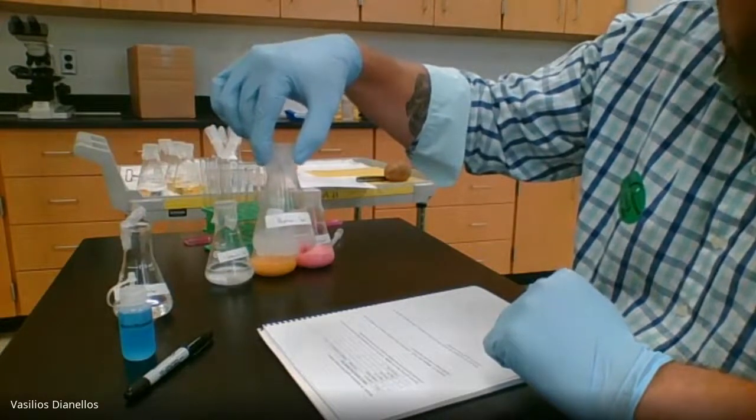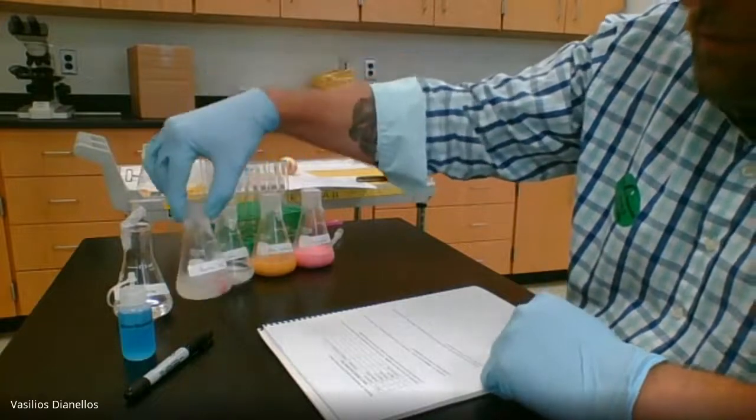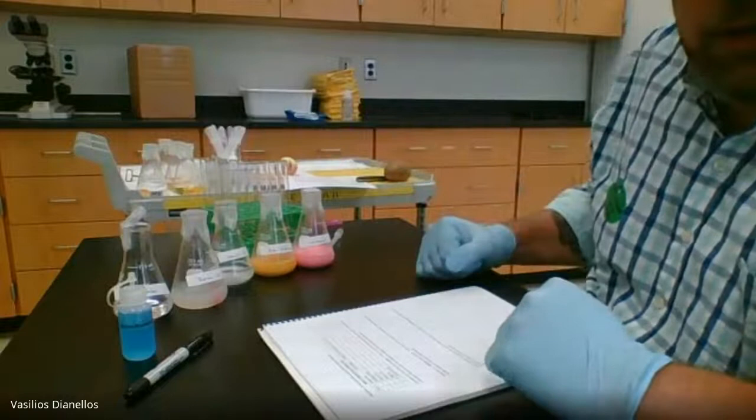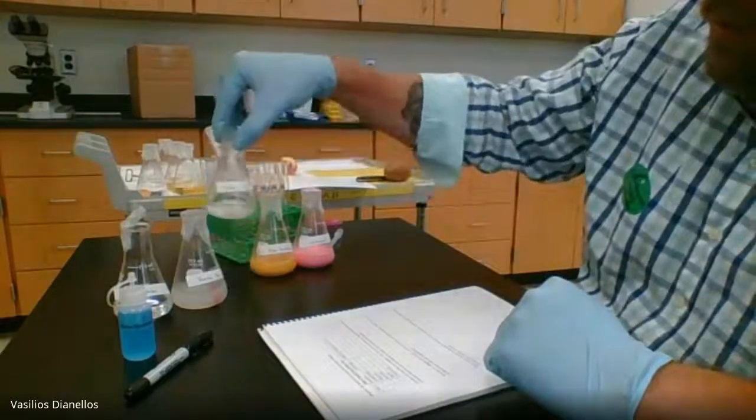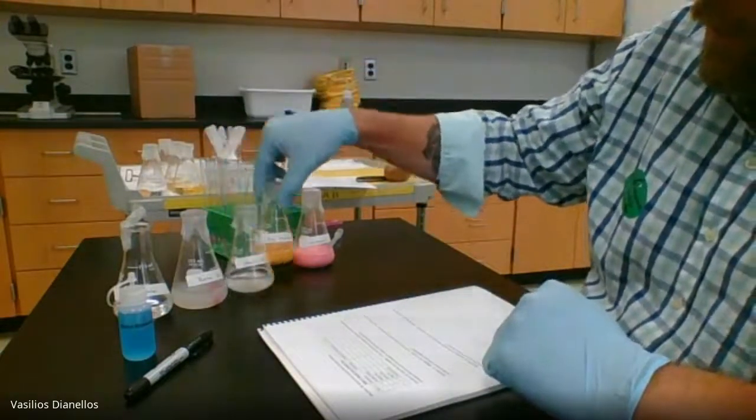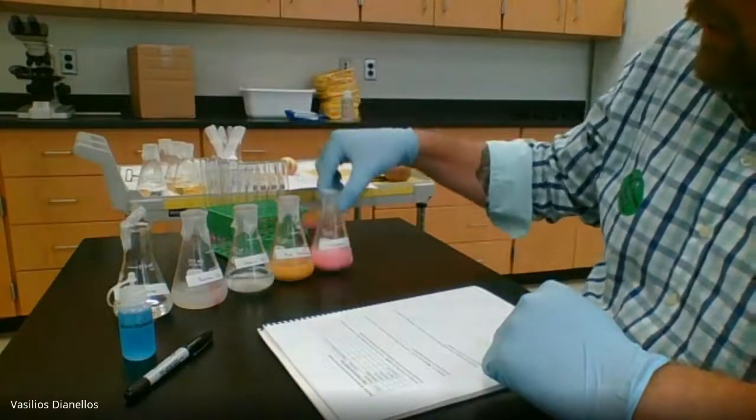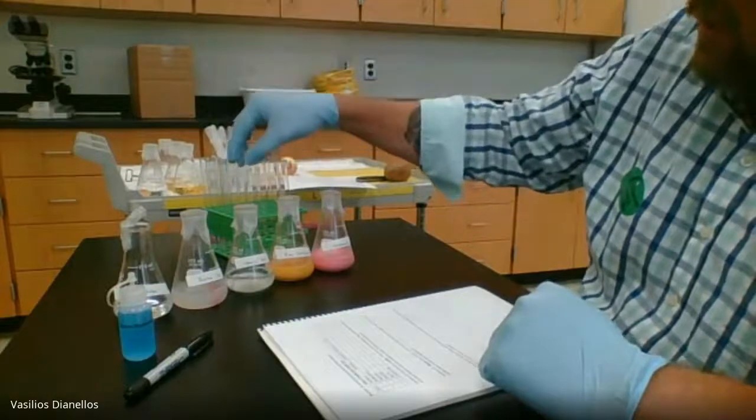The three substances we are testing for protein are the starch solution, the egg solution, and the unknown. I will be putting each of these solutions into a test tube marked at two centimeters.